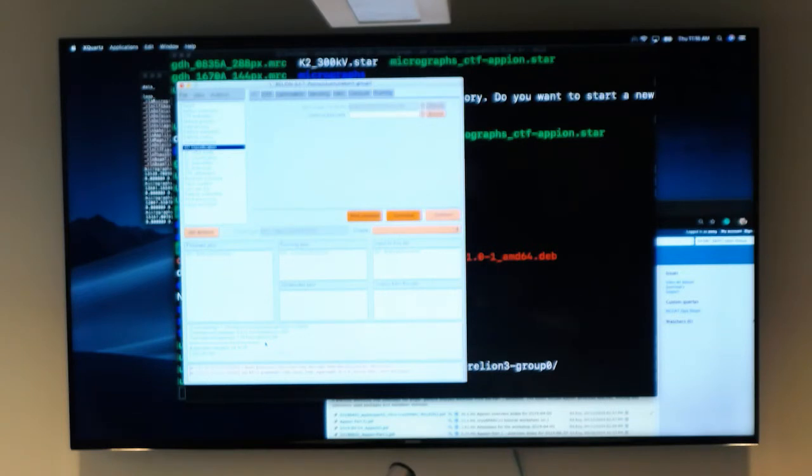Your folder, there's home. Let's see if it actually sees the video card. It's just that the files are safely in another directory, and we can link because we don't want them to be backdated. They're not running anything. It says no running processes found. Let's just set the Relion link again, because I didn't link that correctly, that's why it had a problem finding the files.